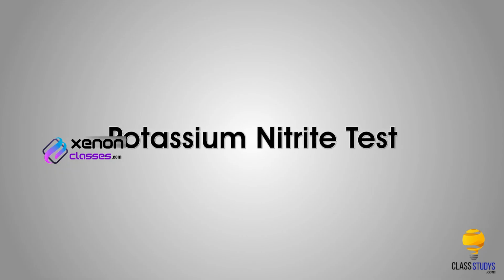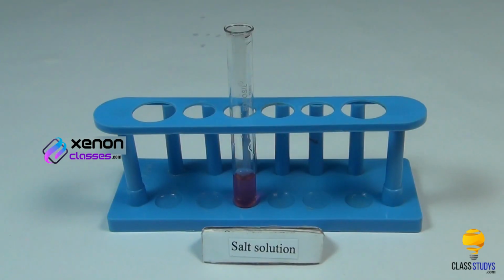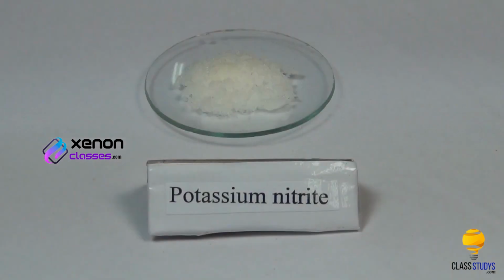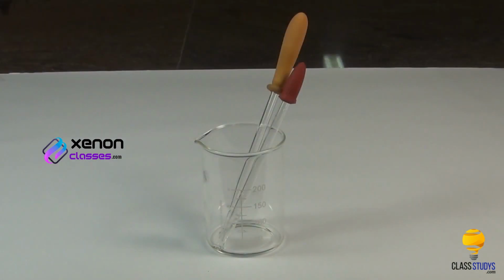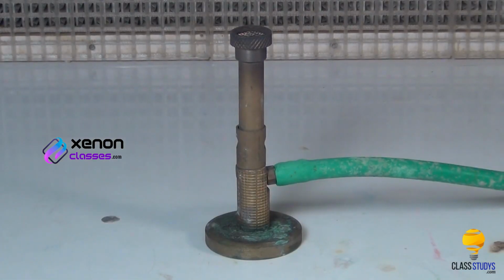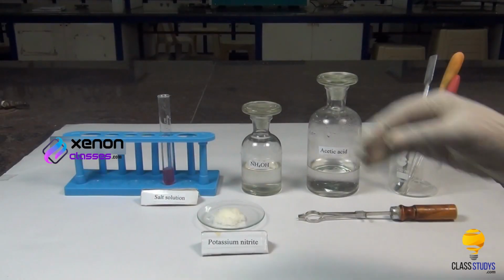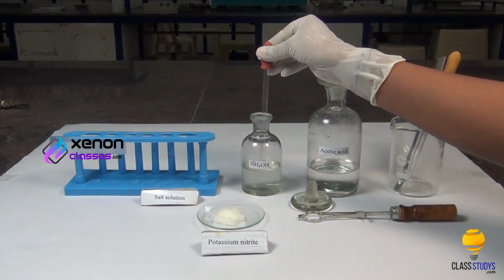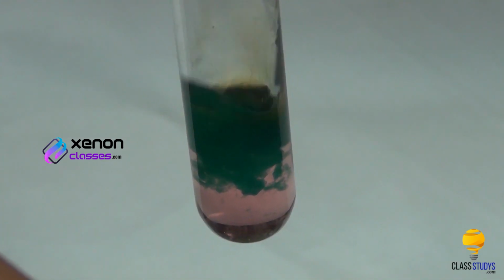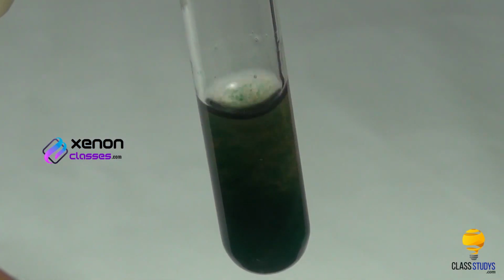Potassium nitrite test. Materials required: salt solution in a test tube, ammonium hydroxide, acetic acid, potassium nitrite, droppers, spatula, test tube holder and Bunsen burner. Procedure: take a small quantity of salt solution in a test tube. To this, add a small quantity of ammonium hydroxide to neutralize the solution. Add a small quantity of acetic acid using a dropper.